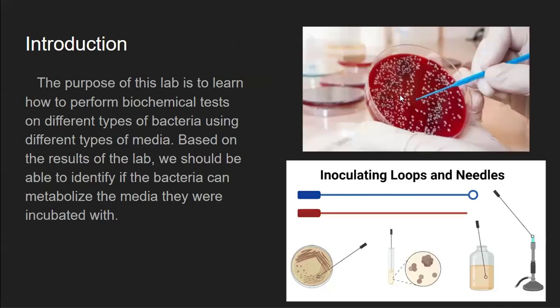Introduction. The purpose of this lab is to learn how to perform biochemical tests on different types of bacteria using different types of media. Based on the results of the lab, we should be able to identify if the bacteria can metabolize the media they were incubated with.